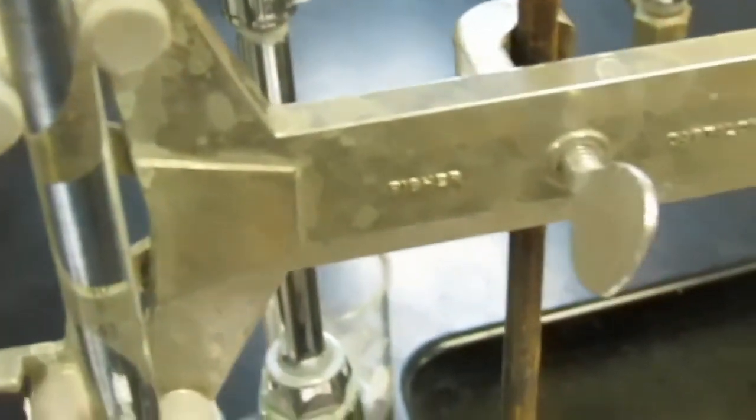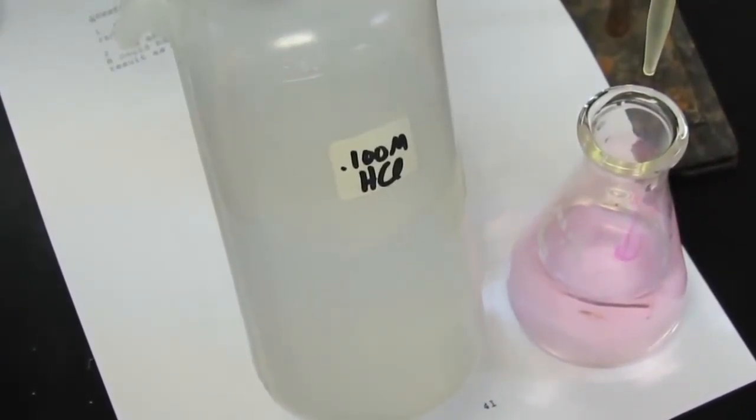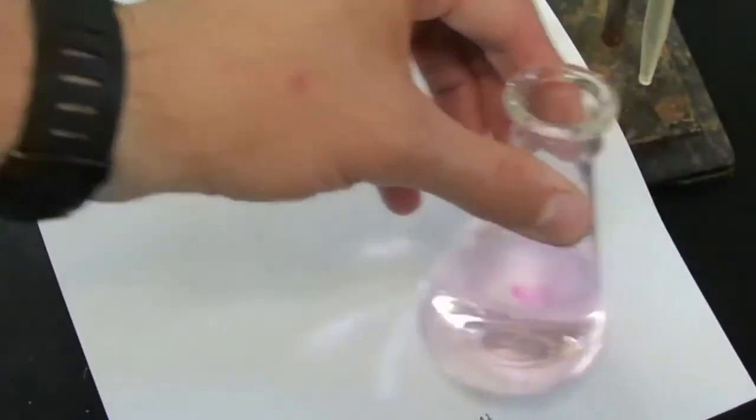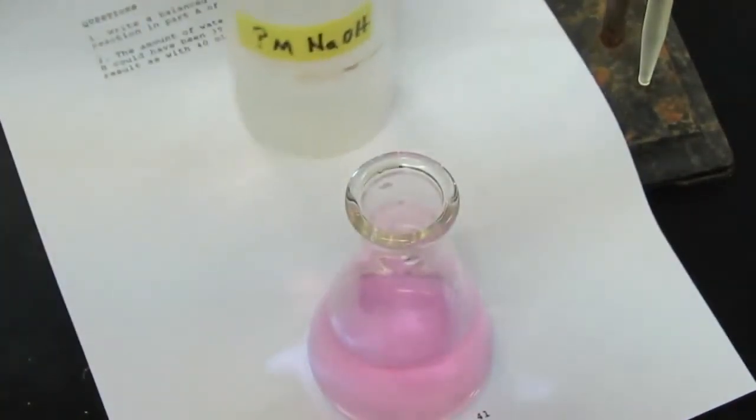So we've finished our titration. You guys know the molarity of the acid. Once again, the acid was 0.100 molar hydrochloric acid. We do not know, of course, the molarity of the base. That's the objective in the first part of this experiment, and that's to find the molarity of that base. So you now have enough information to do that.